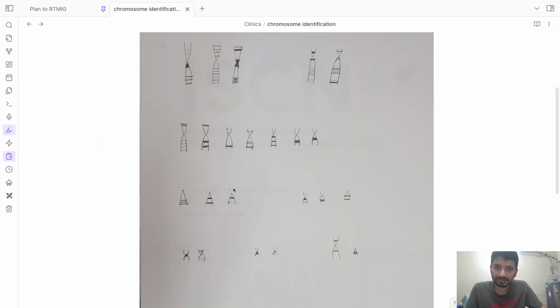So that makes this identification easy. Chromosome 18 is somewhat difficult to identify. I have several times labeled this wrongly, especially because it appears very different on different metaphases. But what is typically told about this is that it has the appearance of a frock or a skirt. I think a skirt is the more appropriate term here. So this looks like that garment with these frills. So you can see a centromere extending, and then these two bands, which look like frills on a skirt.